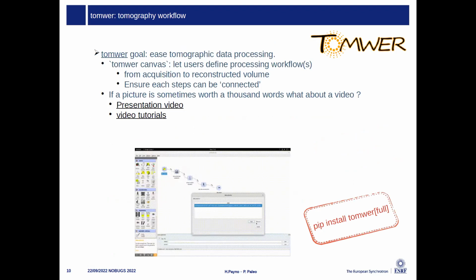Then last point, it's on tomwer, which is basically the simplest way to see it. It provides an interface to let users define their processing workflow. And instead of speaking too much, I will show you a short video.